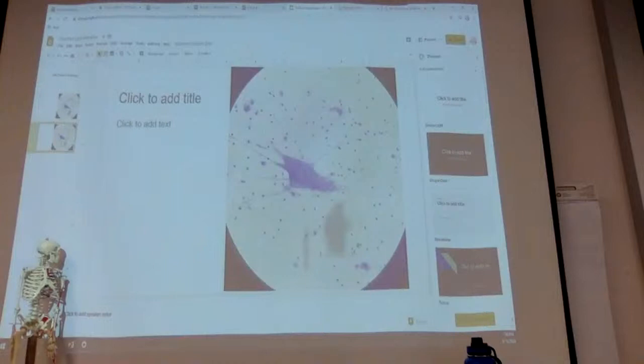And I'm going to label this one. So this is unlabeled. This is labeled. I'm going to label it by selecting things like at the top menu, you can add an arrow. So here's the arrow tool. I'm going to change the color just so you can see it and make it thicker. So I can change the line thickness. I'm going to change it to 4 pixels.